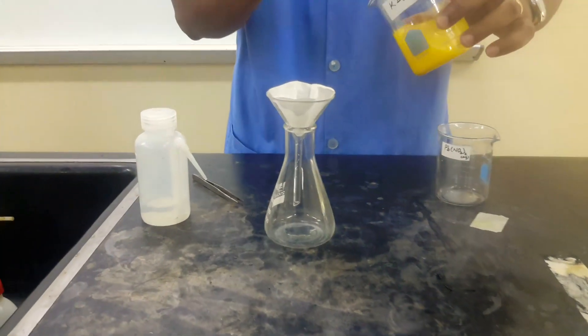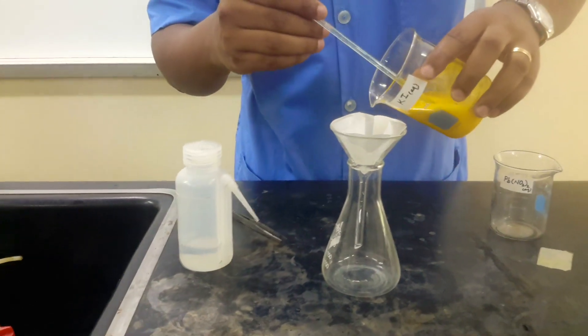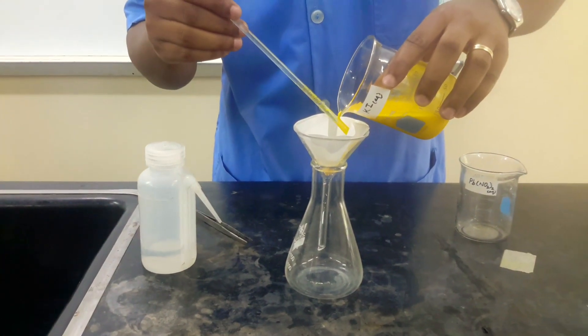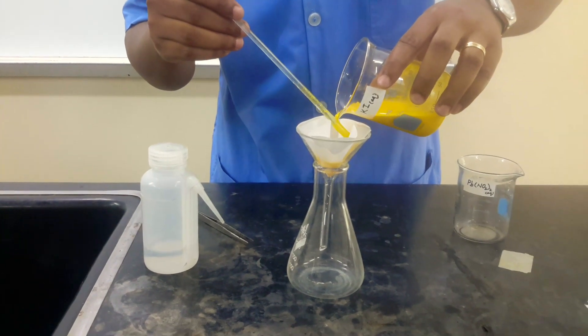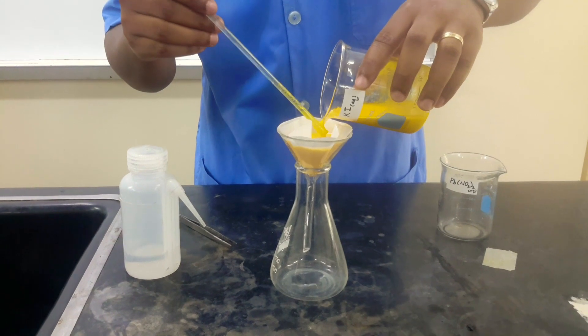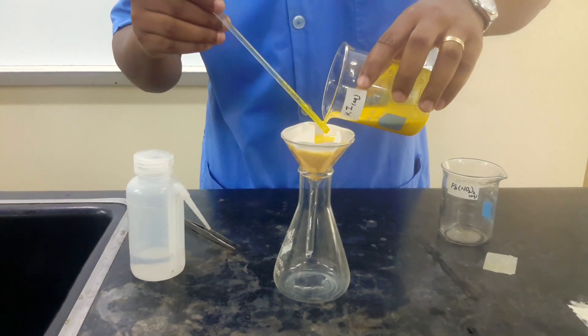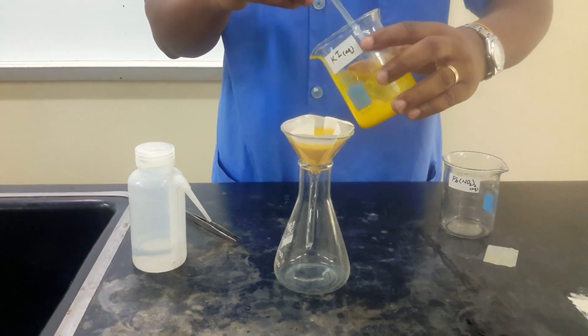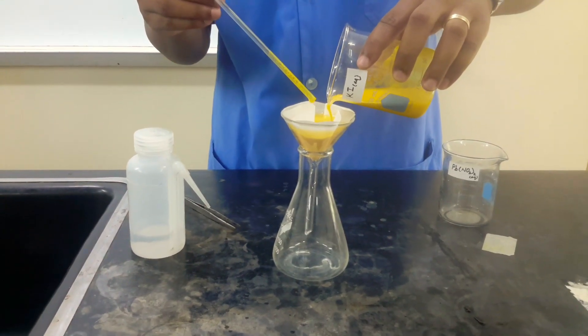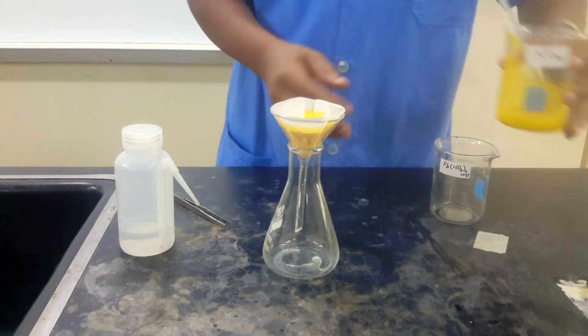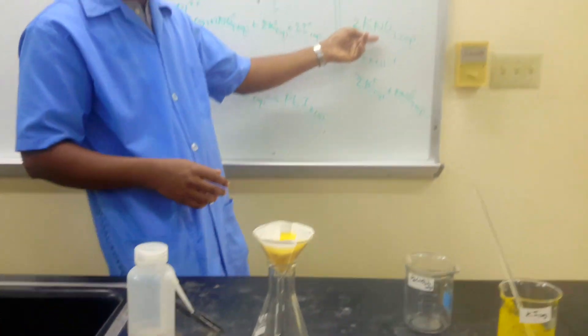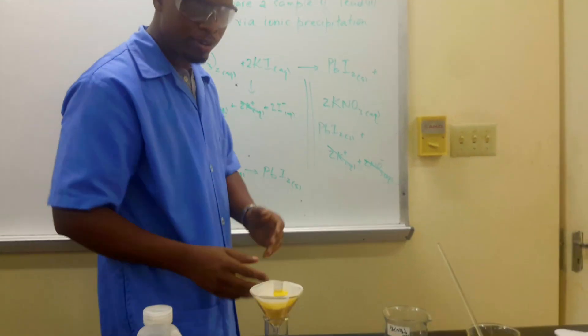Then we'll filter. We can use the glass rod as a policeman to guide the flow of the mixture. And of course we'll wait. We can't rush it. Science can't rush. So we'll just wait.